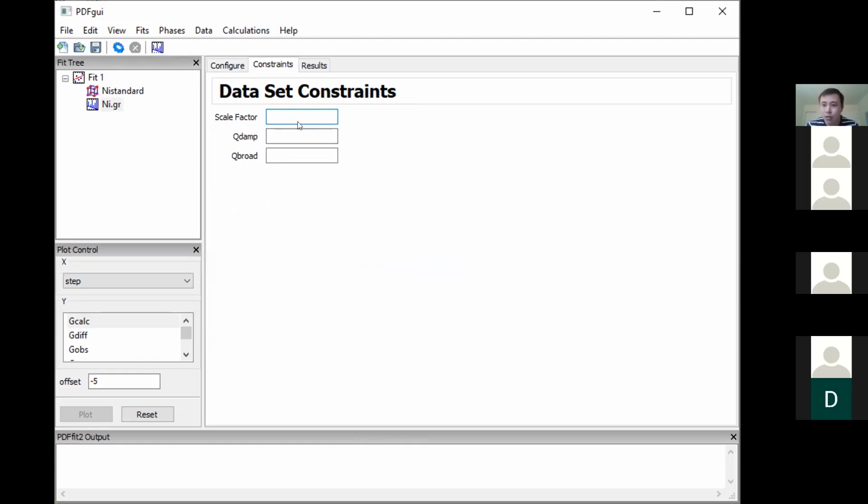What I normally do is actually I would define it at 100. Why do I do this? Because we need to save some numbers for their structures, and this is a little bit tricky, right? You will see that you will be meeting with several numbers, and it's very easy to lose track of which one corresponds to what physical meaning.